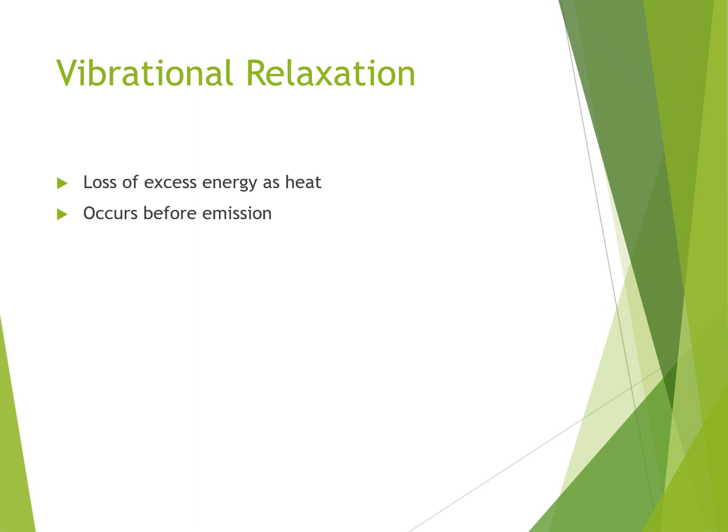So the excess energy is lost as heat before the occurrence of emission. That is vibrational relaxation.